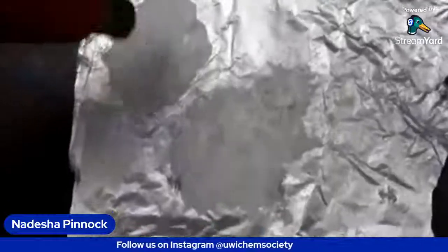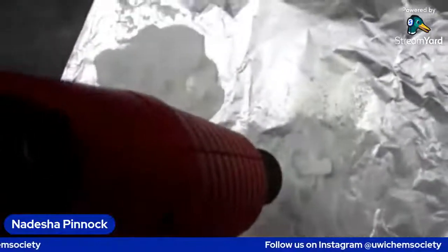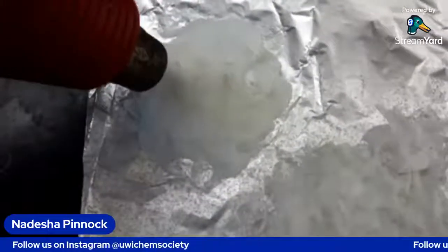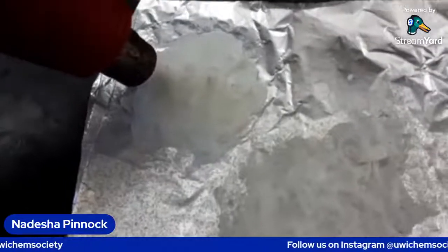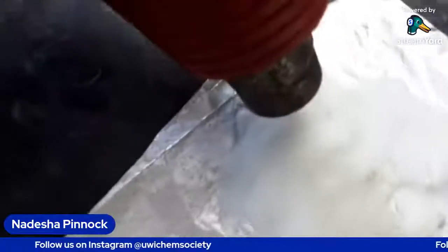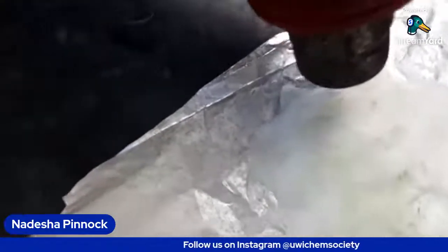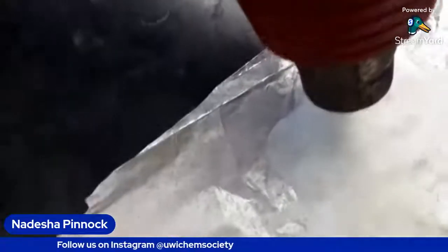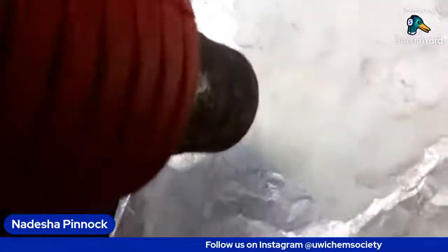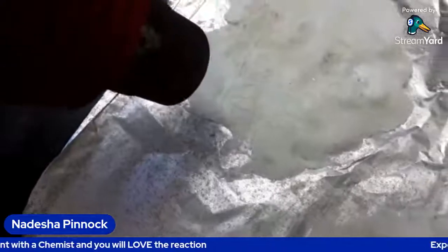So we're just adding some heat right now. And visibly, you can see the plastic looking drier. Getting dry. Right here, the heat density, you can see a white part. It looks a little bit flaky, or it can crack. Yeah, there it is. So it's drying.